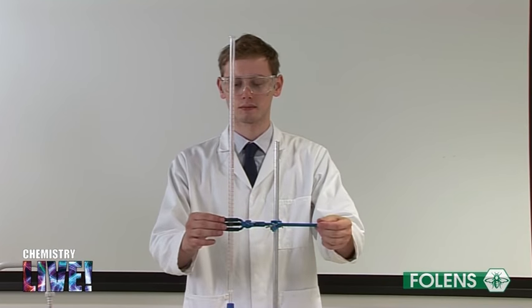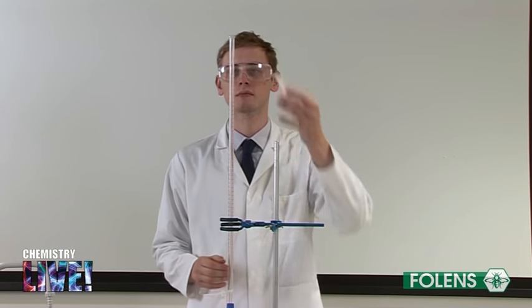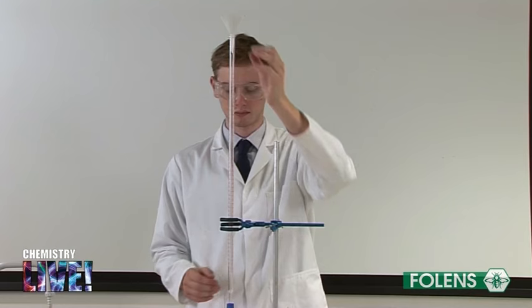In the fifth part of the experiment, clamp the burette vertically using the retort stand. Using a small funnel, fill the burette almost completely with the dilute hydrochloric acid solution.